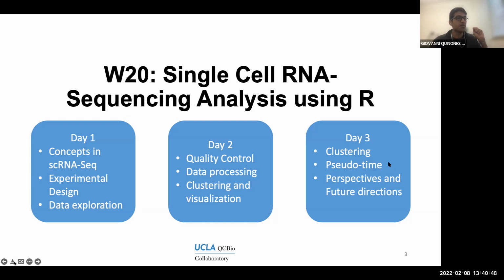It's really become a focal point in this field, because this pseudo-time trajectory is the method by which researchers learn a lot about the lineage of tissues, differentiation of cells, and obtaining cell lineages and so on.